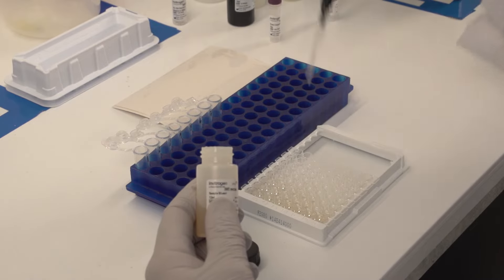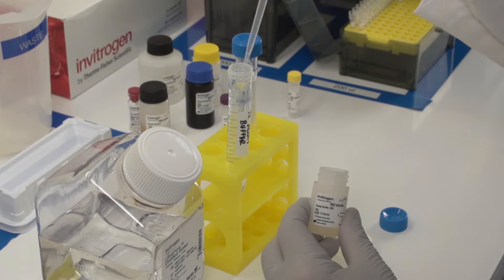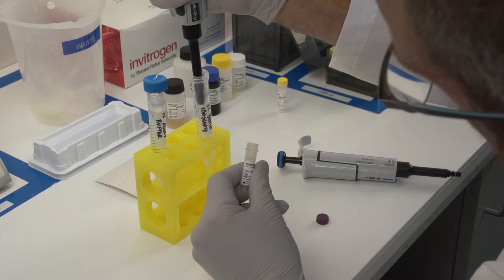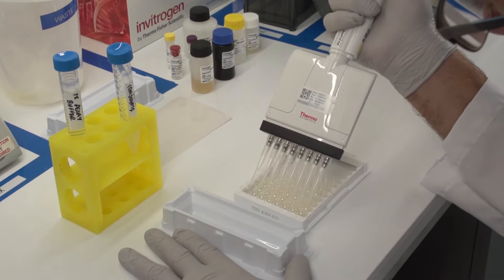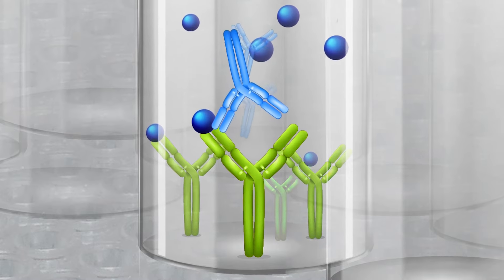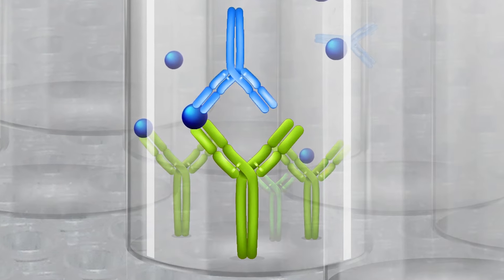We will show an example of a co-incubation protocol. Dilute assay buffer concentrate with distilled water. Dilute biotin conjugate concentrate with assay buffer. Add biotin conjugate to the ELISA plate. During this step, the biotin conjugated detector antibody will bind to the antigen at a different site than the capture antibody, creating a sandwich.